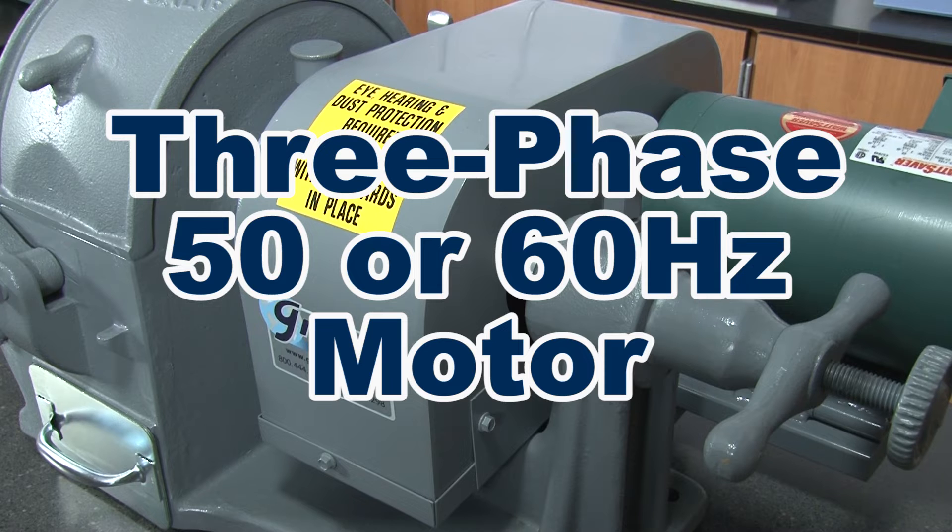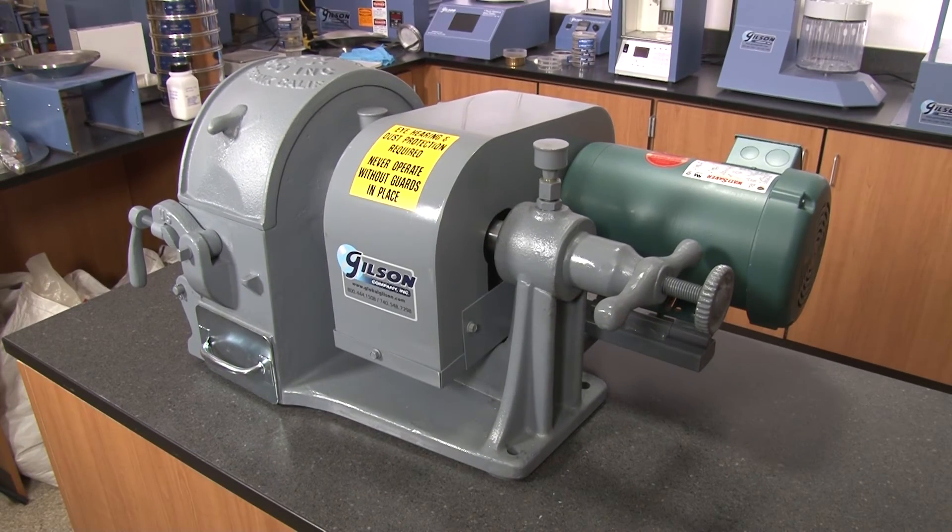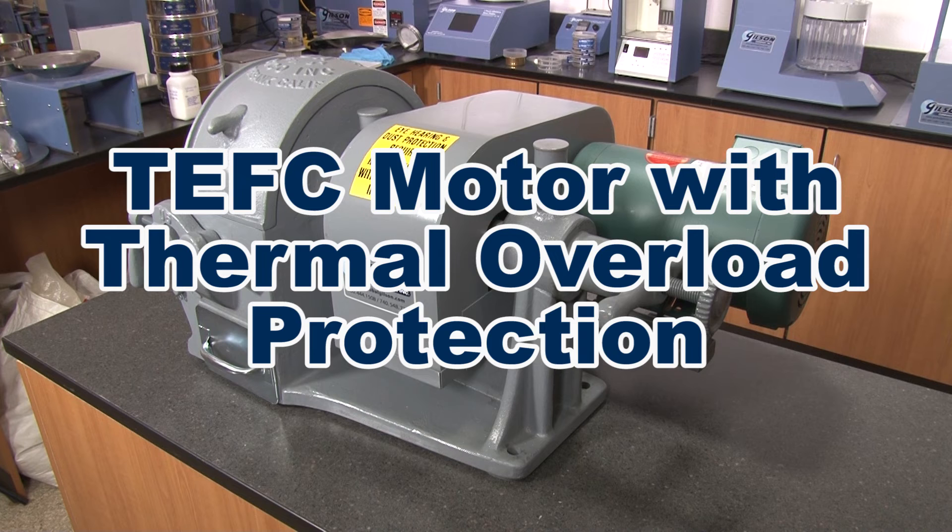This three-phase motor can be set to operate on either 220 or 440 voltage, and the motor is totally enclosed with thermal overload protection for additional operator safety.